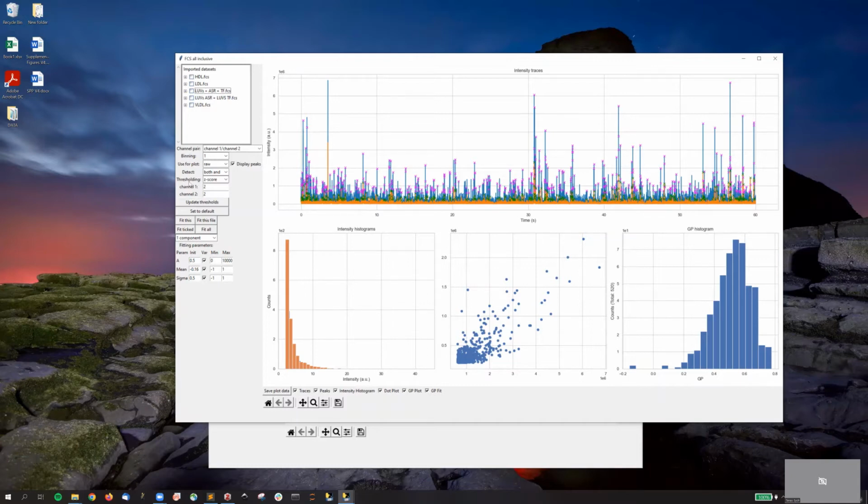The recommended way to do the thresholding is the so-called z-score, and z-score is actually displaying how far away, in terms of sigma, your peak is from the mean value. So it is recommended to work with a z-score of at least 3. I would go also for 2. It usually gives good data.